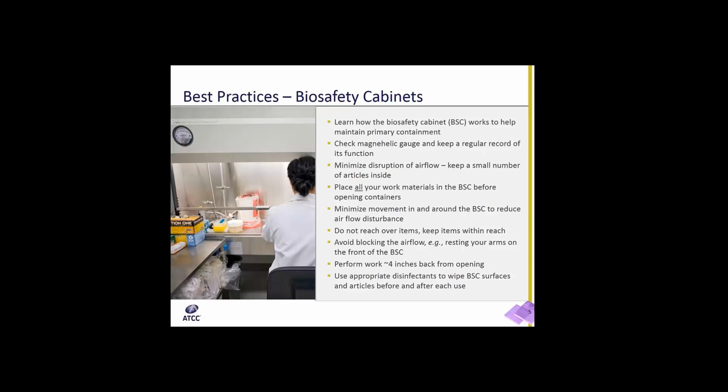and also use appropriate disinfectants to wipe all surfaces of the cabinet as well as any article that you take in and out of the cabinet before and after each use. For more details, the OSHA website has a fact sheet on laboratory biosafety cabinets which explains many of these in further detail.